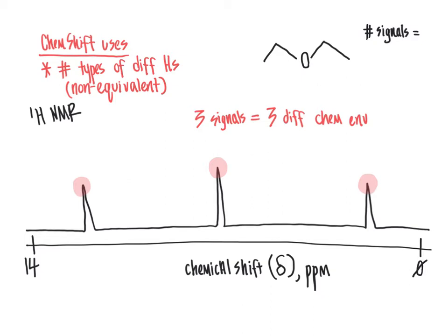So when we look at this molecule, at the terminal ends here, we have a CH3 group here in pink and another one in pink that I'm highlighting, those 2 terminal ends. Those are completely symmetrical within the molecule, and hence those 2 sets of protons are in the exact same chemical environment. And since they are in the same environment, they're going to give one signal within the NMR spectrum.